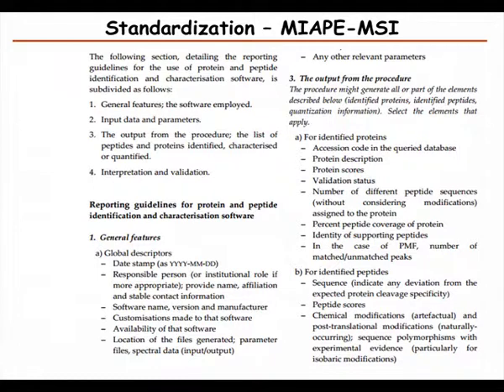So this, for example, is for mass spectrometry information. These documents go through and say what information should be given, and some of it is things like when was this data acquired, what software was used, what customization, and so on, and then more description of what the source of the material was, and all these details.